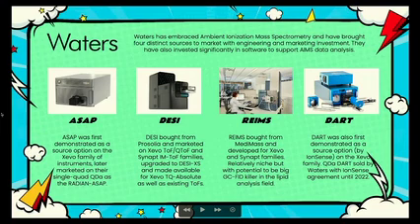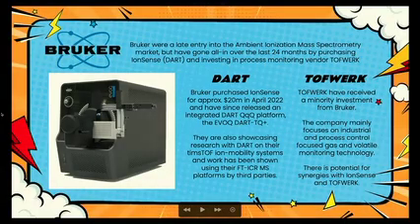And then there's DART QDA. It's sort of drifted away now that IonSense was bought out by Bruker, and DART sort of sits now more with Bruker, but people might well have a DART QDA system or be aware of it, so I'm just mentioning it here. The sort of use of DART has kind of been supplemented by ASAP on the single quadrupole family. But it does exist, so I'm just making you aware of it if you see it in the field, or you end up in a lab and you see a little single quad with a big blue source sticking out the front. It's there. Waters are still supporting it as well for a few years post-Bruker takeover.